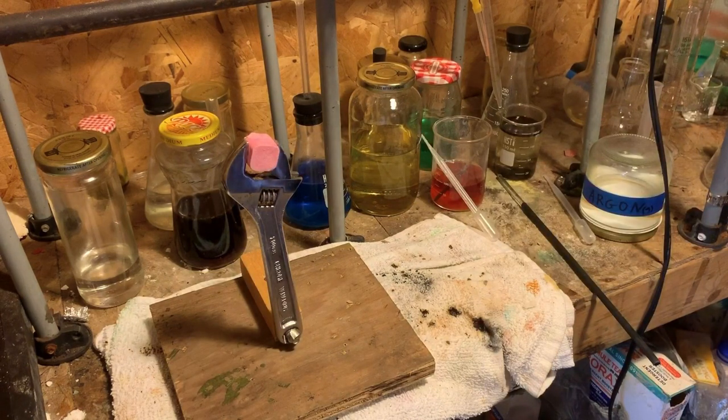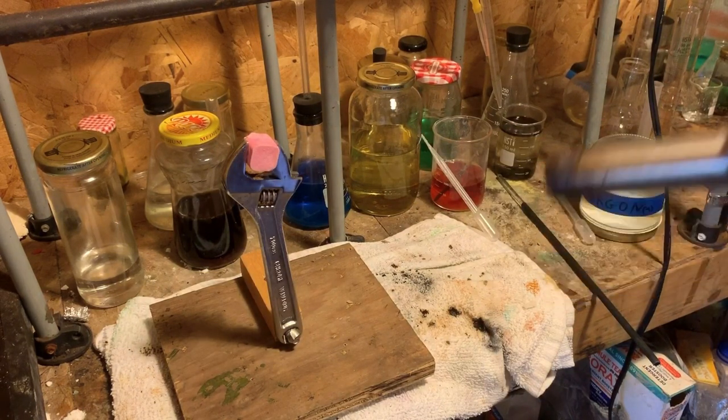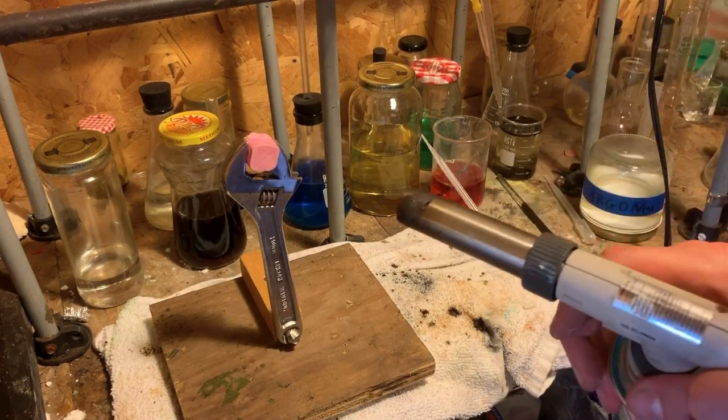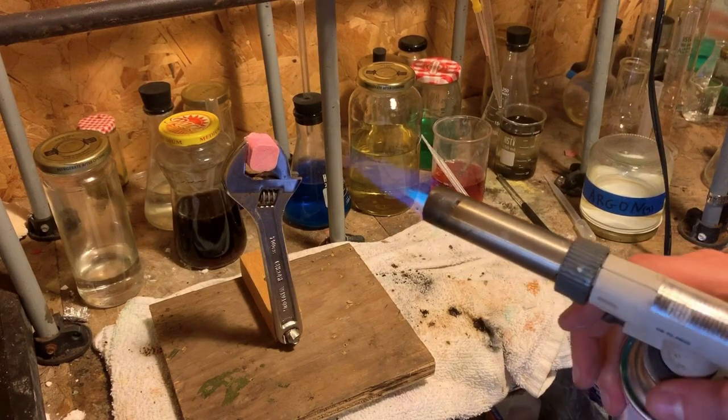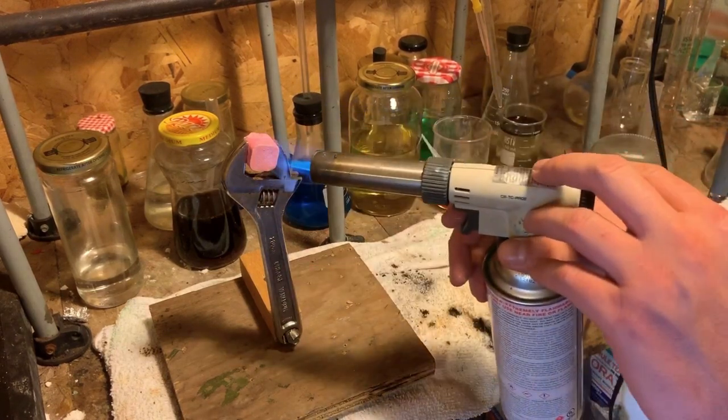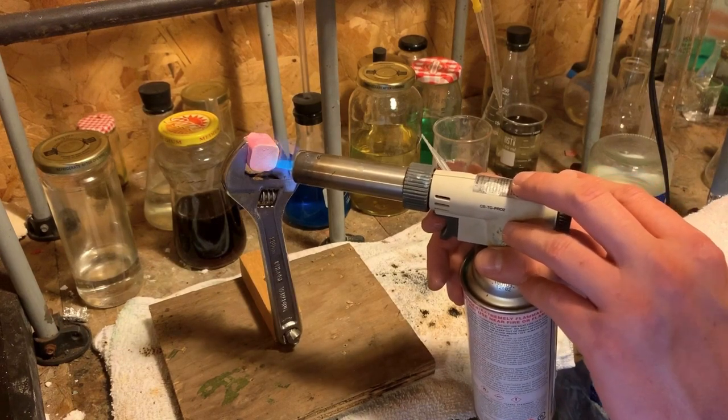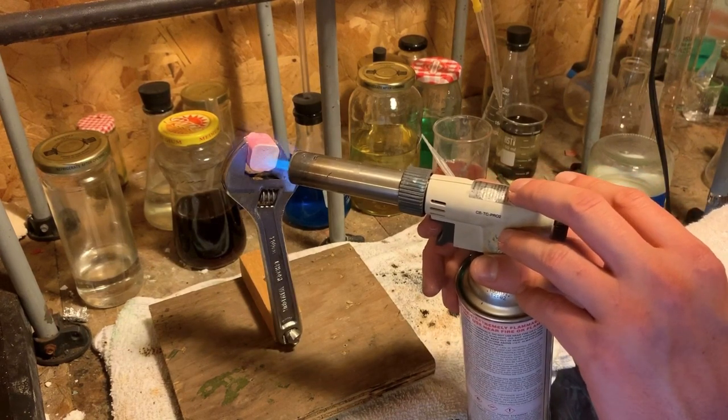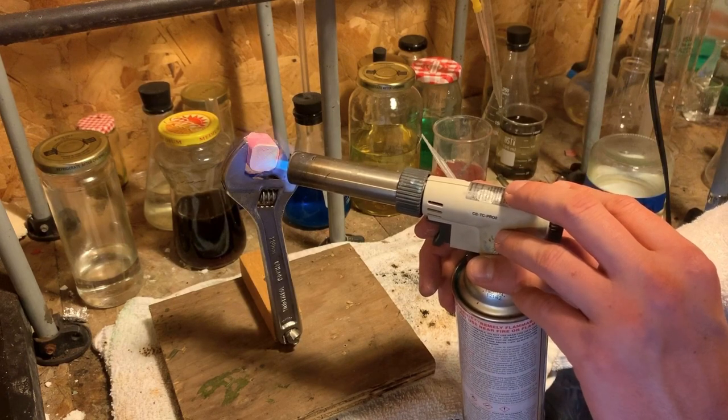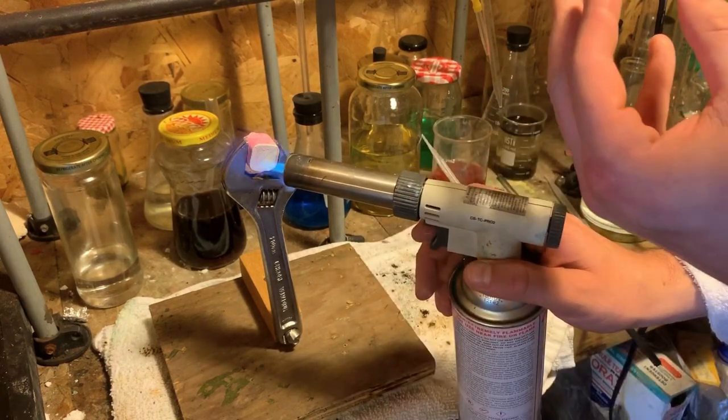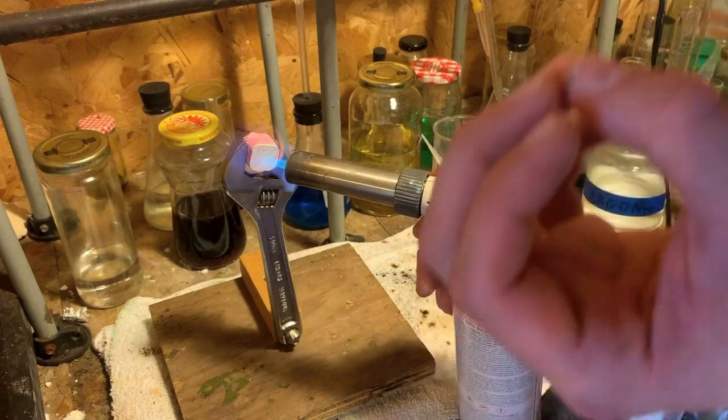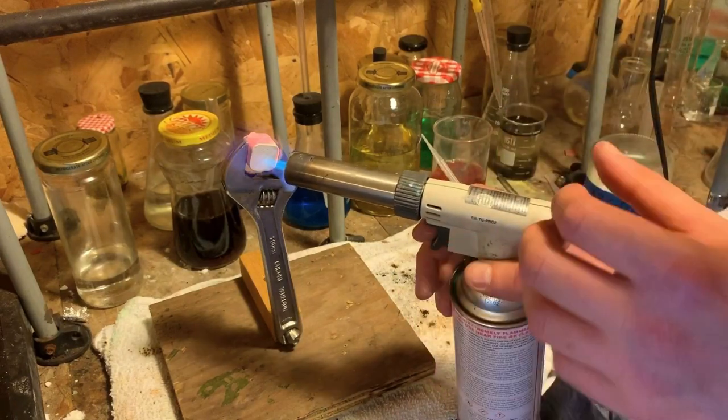You're going to see a color change take place here upon heating. This is going to turn white, and that indicates that the carbon dioxide gas is being liberated, thus in turn the calcium oxide is left behind.